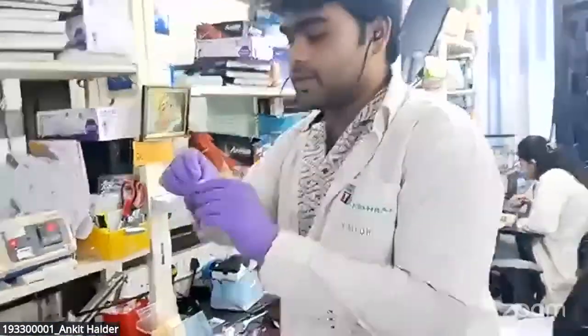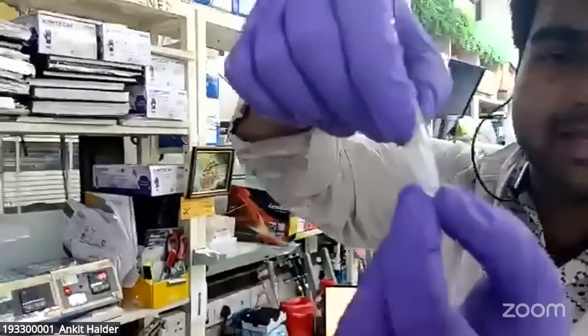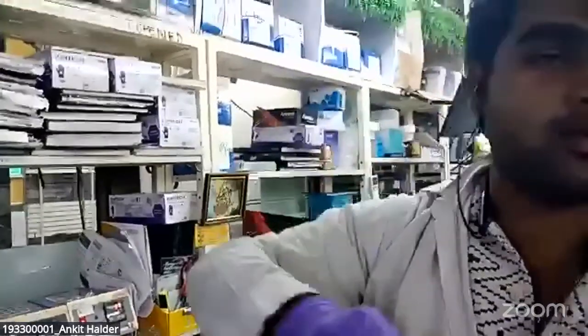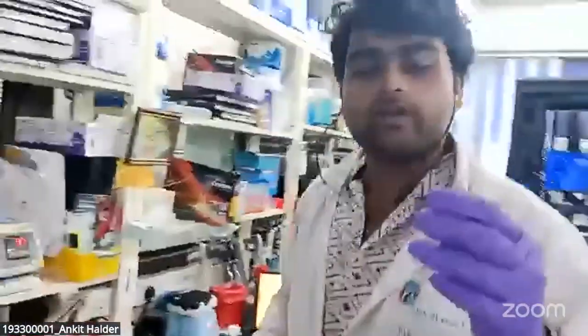after the entire process, you will have the peptides here. You can see a very small amount of peptides here, and you need to add the FA to resolubilize the peptides. After that, we need to find out what the peptide concentration is. For that, you need two different wavelengths: one is 205 nanometer, and the other is 280 nanometer.